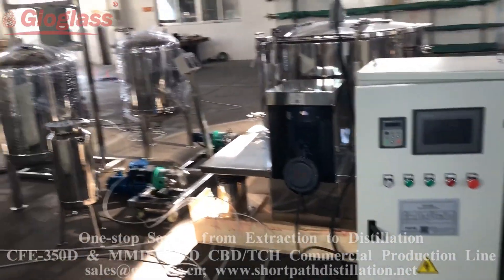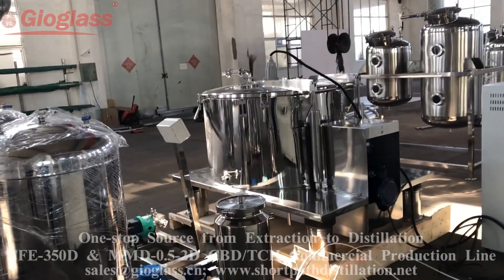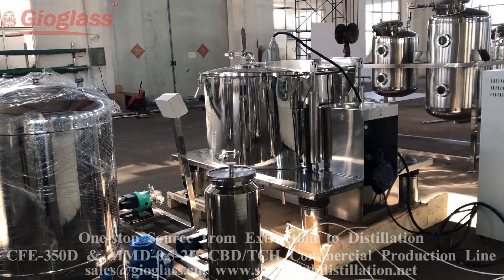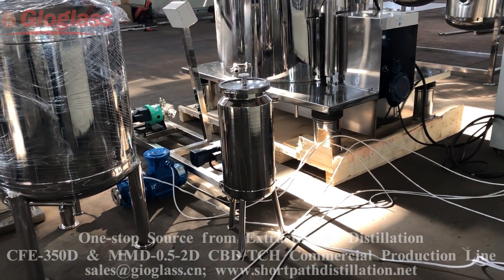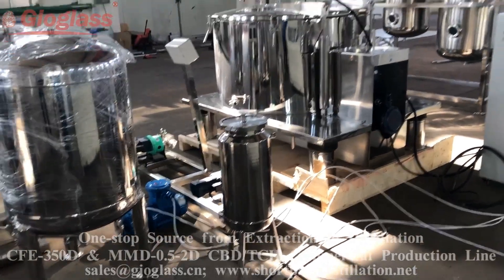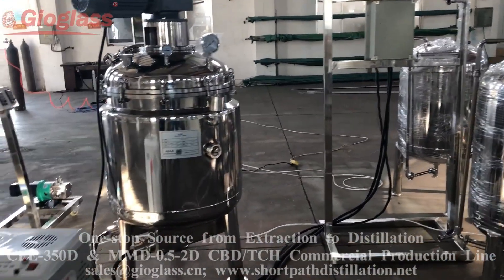After the extraction, the crude oil will be pumped into the filter to remove the impurity. Then the crude oil will be pumped into the flash evaporation reactor.